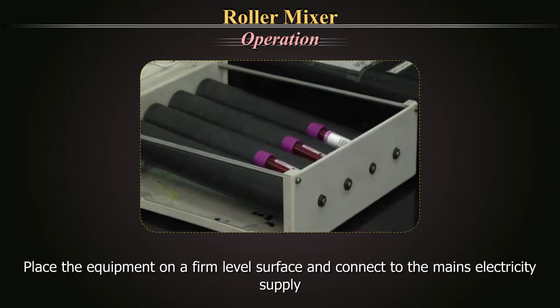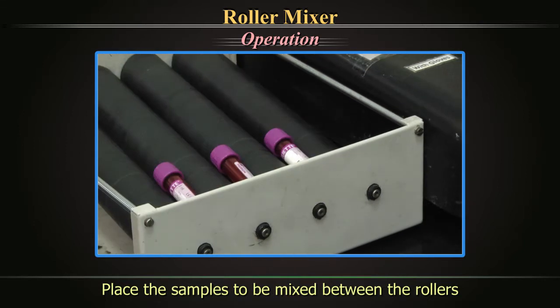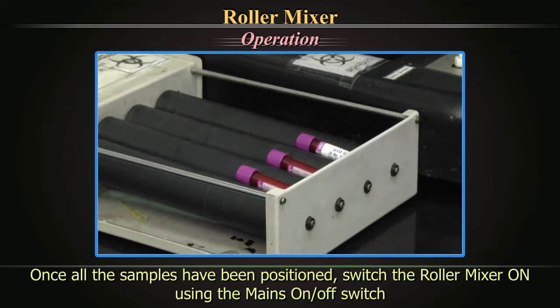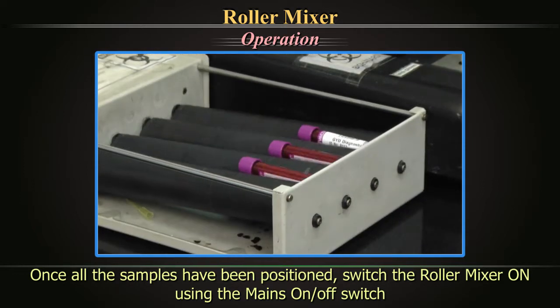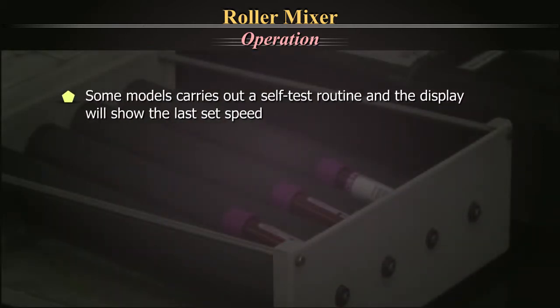Operation: Place the equipment on a firm level surface and connect to the mains electricity supply. Place the sample to be mixed between the rollers. Once all the samples have been positioned, switch the roller mixer ON using the mains OFF/ON switch. The device, in some models, carries out a self-test routine and the display shows the last set speed.